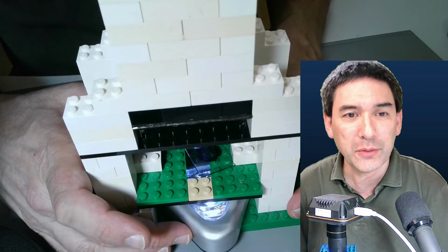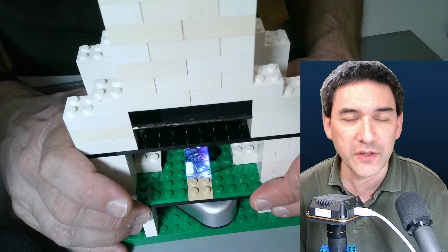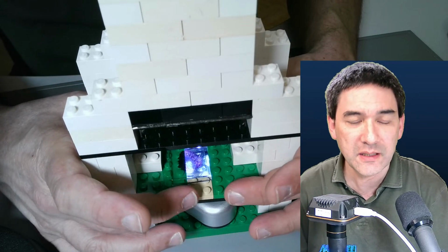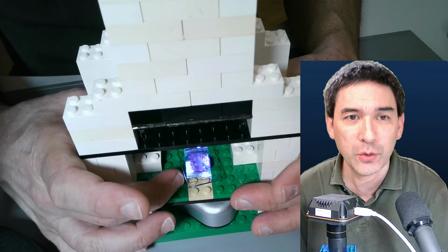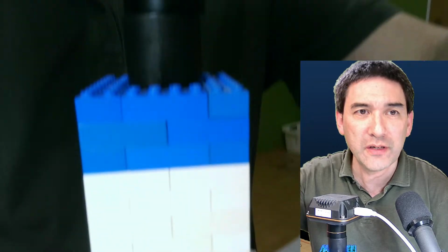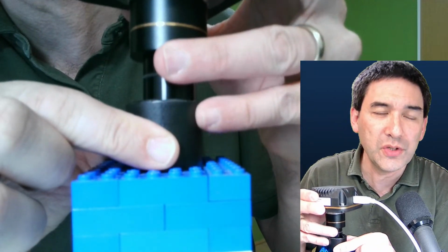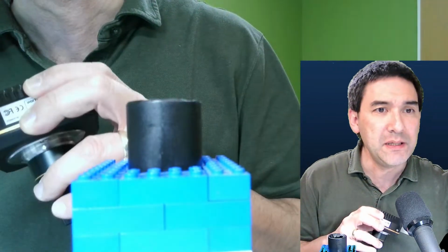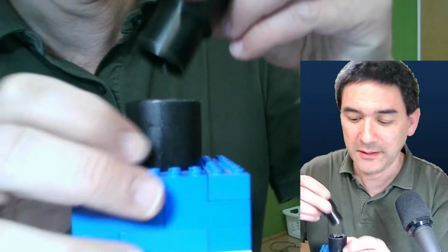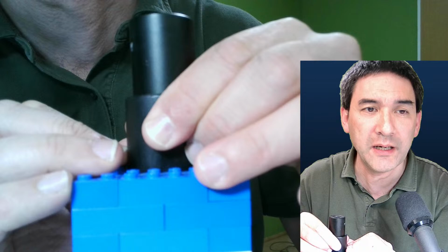What you see here on the bottom is of course the lamp, no condenser, nothing at all. This one over here I made in such a way that you can move it up and down. The stage contains a hole for the specimen over here. I'm now going to move it up here. So there's a tube, of course, and here on the top I added a camera. However, you can of course also add an eyepiece. Don't drop it. And you can focus the microscope by pulling up and down on this plastic tube here.